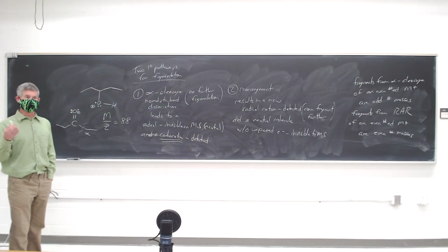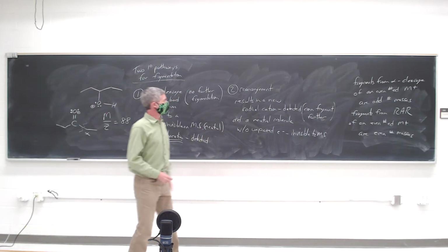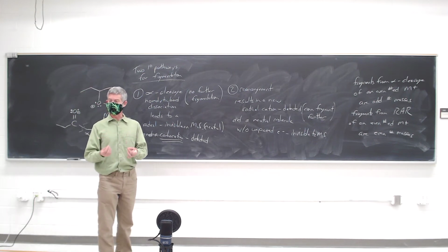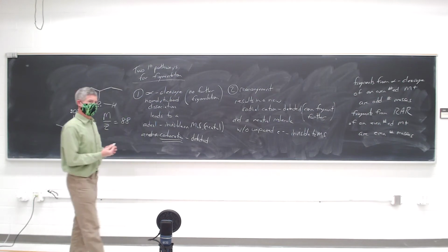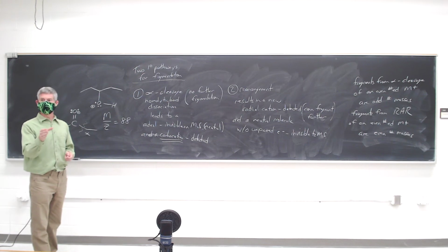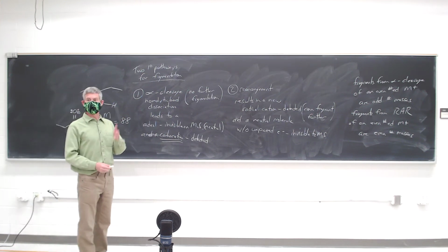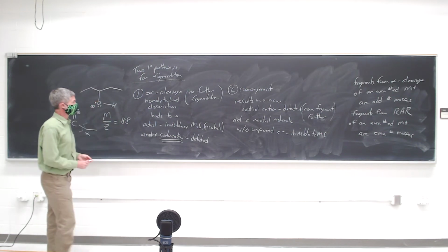Mass spec, by the way, is really difficult, because these things fragment in all kinds of weird ways, and you get peaks everywhere. And figuring out what the molecular formula of those peaks is quite challenging in many cases. There are some fragmentations that are common enough that we can actually use them, and then there are some fragmentations that are obscure, and sometimes you can't really tell. Just like the IR, right? Some peaks we can identify what bond they came from, and we know carbonyl is at 1700. Some peaks are just there, because there's a bending mode that absorbs that, but you can't actually tie it to an individual peak, but it does create a really nice fingerprint that will allow us to search the wavelengths.